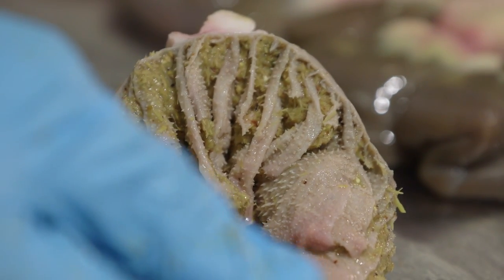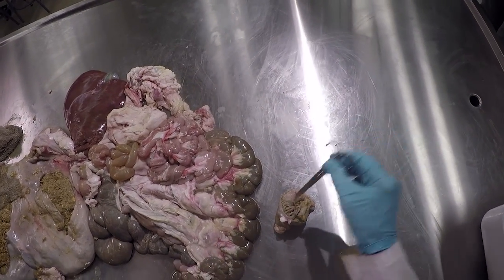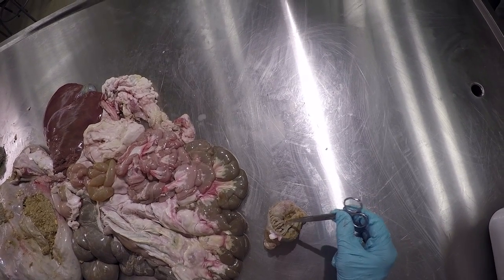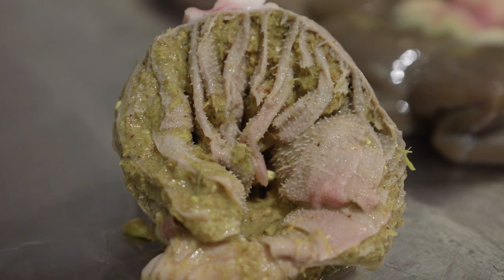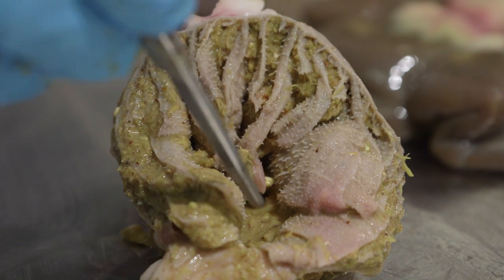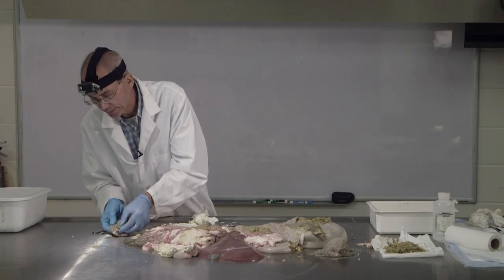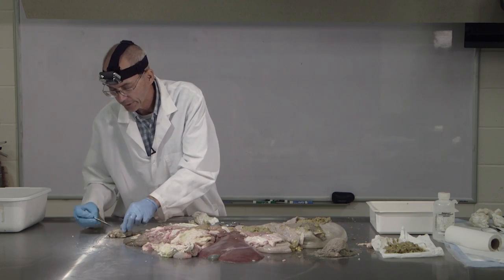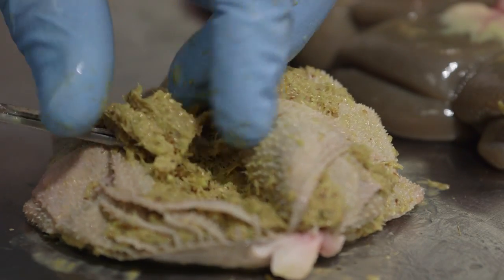Food material is going to be passing like this through the omasum, coming in, and these little sheets of tissue all have little spines on them, and they interdigitate with themselves and create these very narrow channels that then trap very fine food material inside. You can see some of this real fine food material in here.